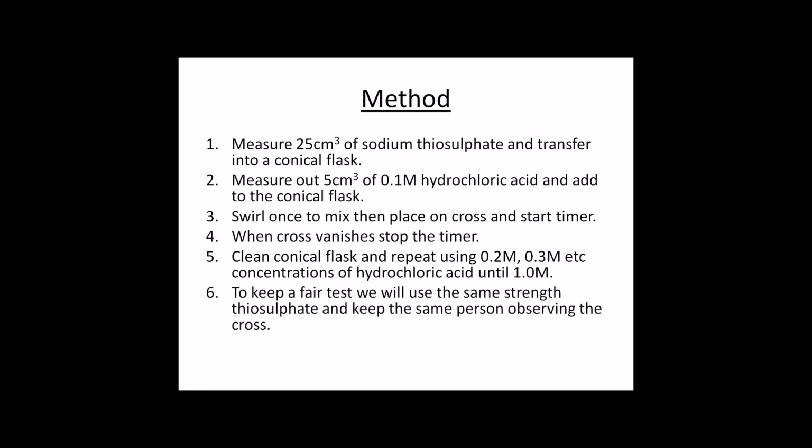To keep it a fair test, you would use the same strength sodium thiosulfate, the same concentration of sodium thiosulfate. We're obviously going to use these volumes. We're going to keep the same person observing the cross, and if you were doing this, there's another way you can do this with temperature, and so you might want to also say keep the temperature the same.